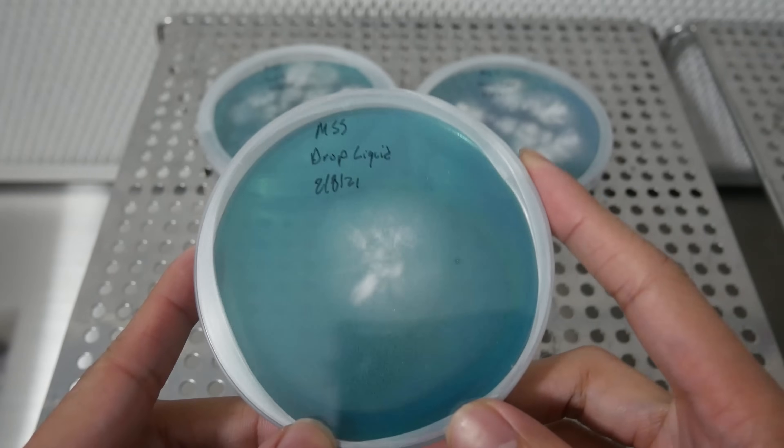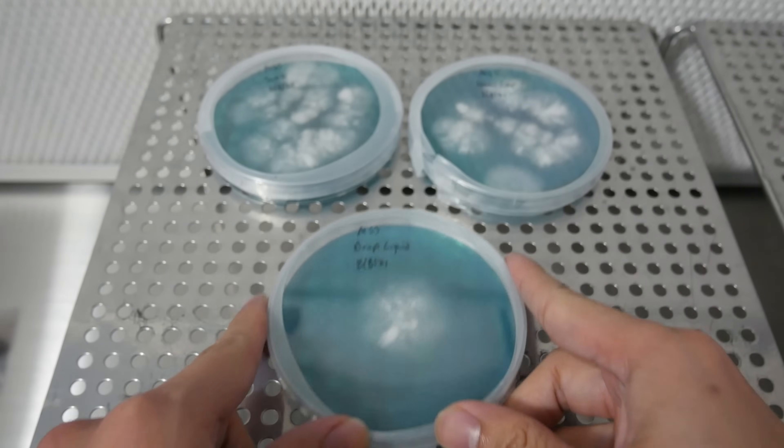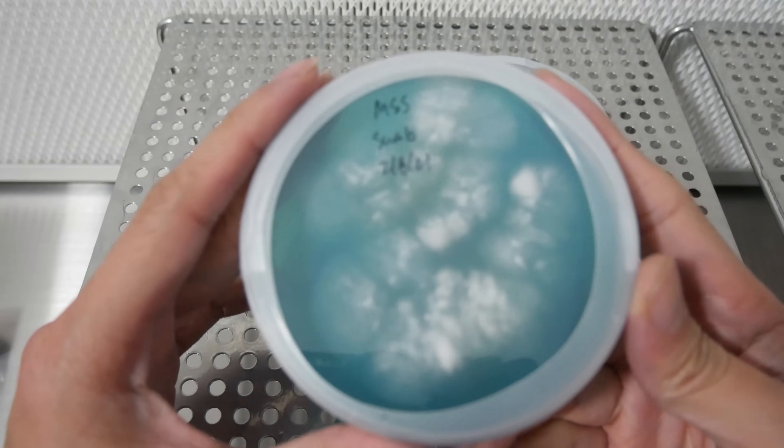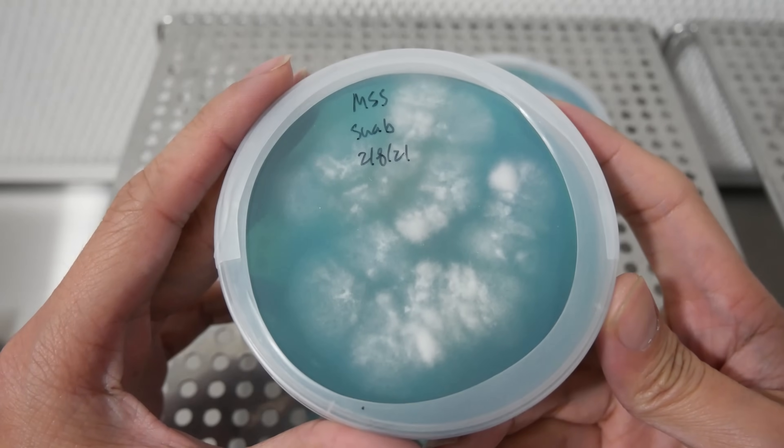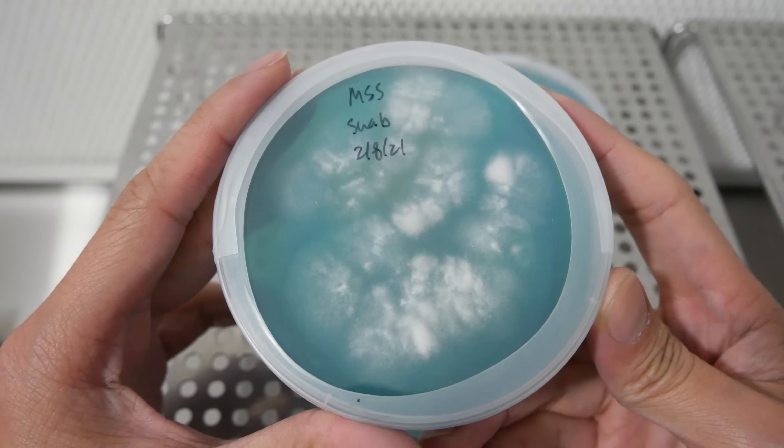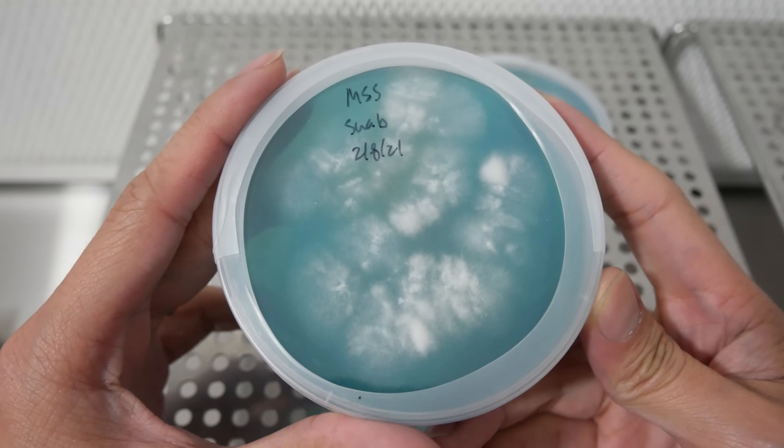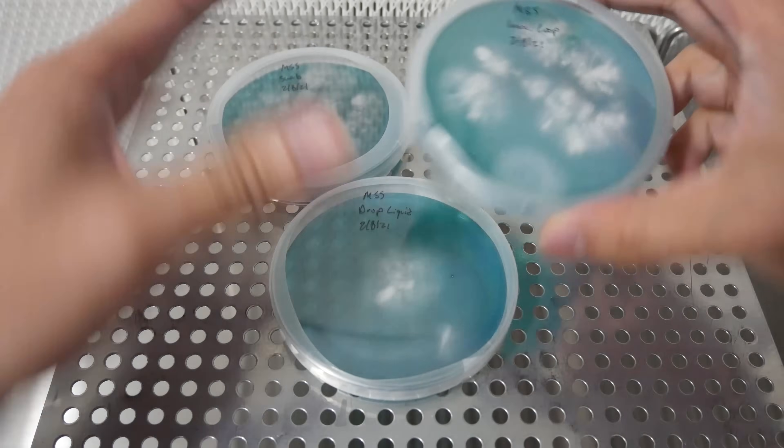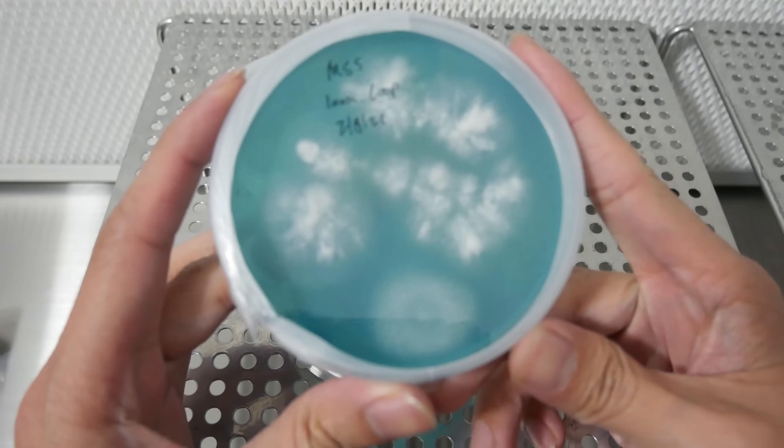Out of the three methods, I really recommend using the swab and loop to inoculate your plates. Here's the swab plate, this one did really well. I might just leave this one out for a couple more days, and if it ends up being clean, I'm gonna put these to grains.